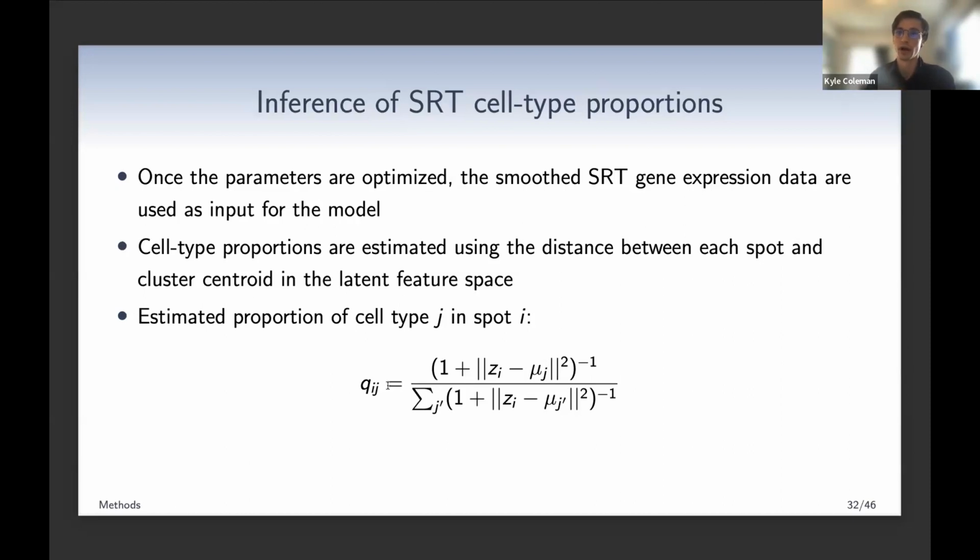All of the other ones were just publicly available from completely different samples. So yeah, it's either one works for sure. So basically we can only use one single cell RNA-seq reference data set at one time, right? Can we use multiple ones also, in terms of the cell type annotation? So how should we choose which single cell RNA-seq data is better for this project, for example, here?